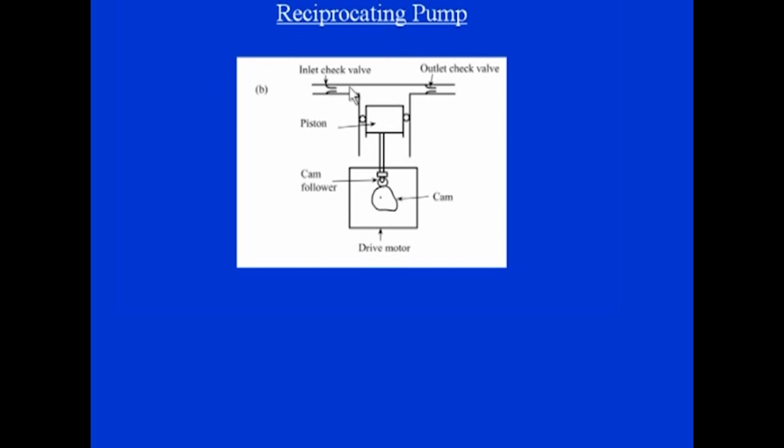So, these two strokes, compression and return, one will let the eluent come into the system and the other will force the eluent into the column. These pumps produce small pulses of flow, and pulse dampeners, as I said, are employed to minimize the effect. So, these are the two kinds of pumps which are utilized: constant displacement pumps, which are constant volume pumps, and reciprocating pumps.